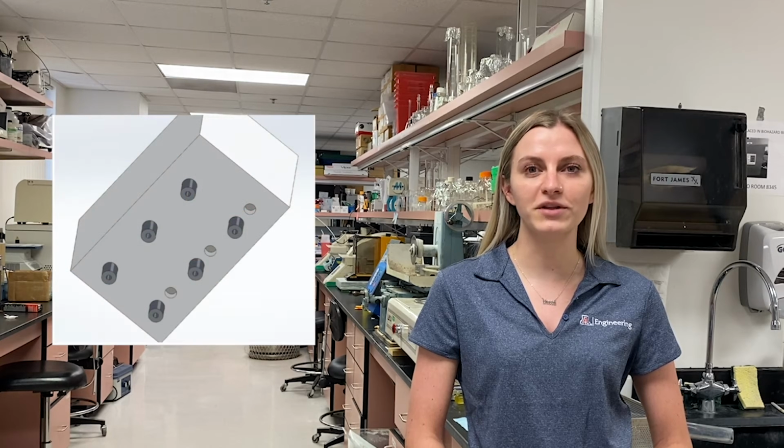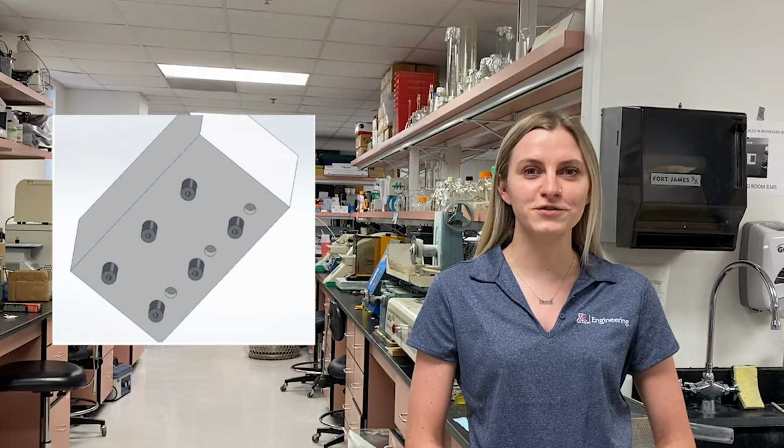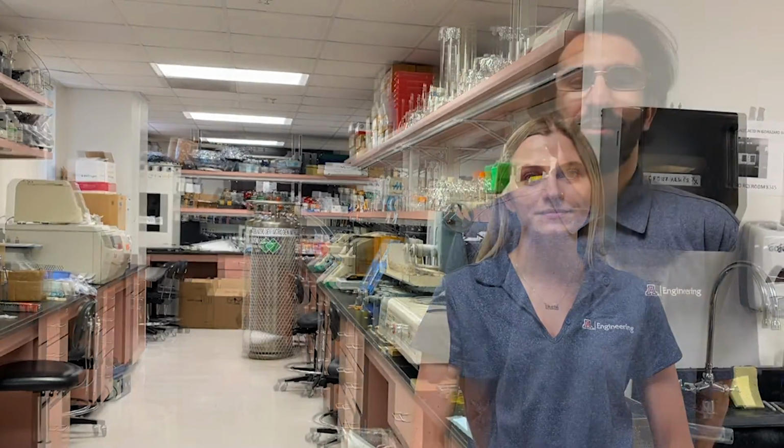Our original design concept included a moving feeder system. The moving unit would incorporate both injection and extraction systems, as well as the photoresistors used for pH monitoring. However, this design concept was changed as we learned that it is very difficult to reapply the conditioning load to the scaffolds once the original load was released because the scaffolds could shift. Therefore, we chose to pursue a new design that does not require the load to be removed.